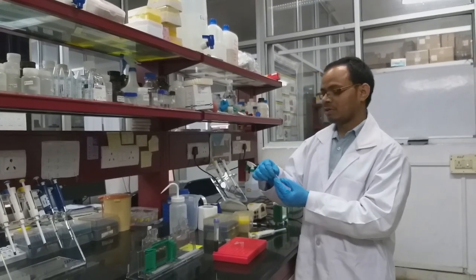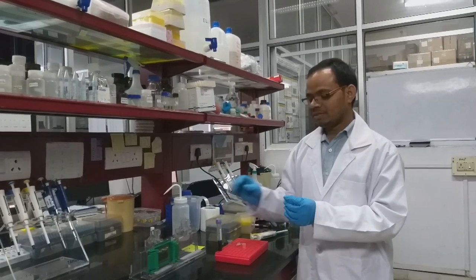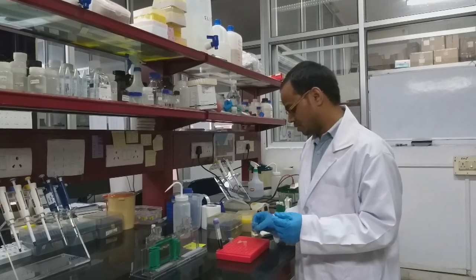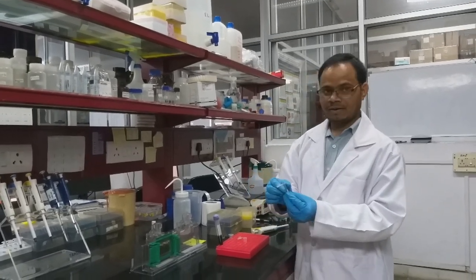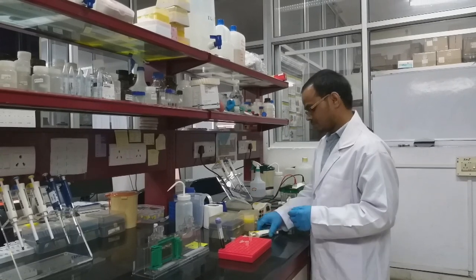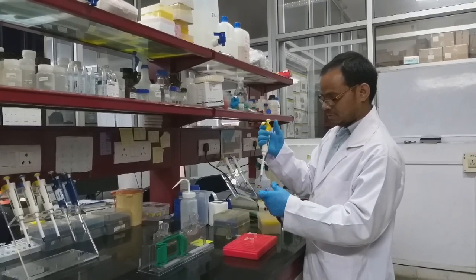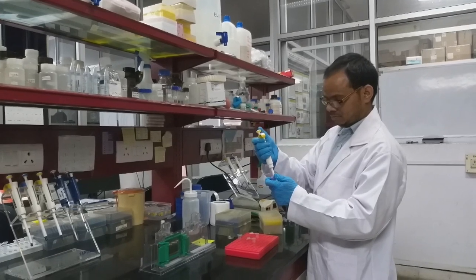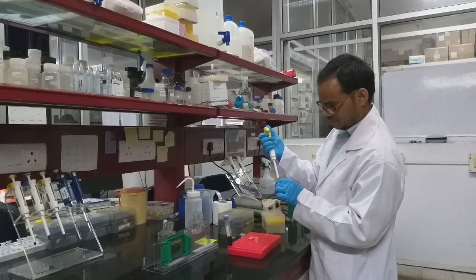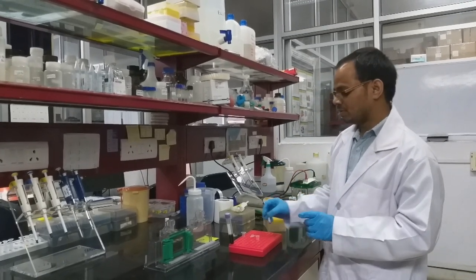Now we have to take the protein solution. Here we already prepared a 10x loading dye, so we have to prepare 1x to mix with the protein solution. So this is 100 microliters of the loading solution. We mix 10 microliters of loading dye into this protein solution. You can tap it down or pipette the protein solution.